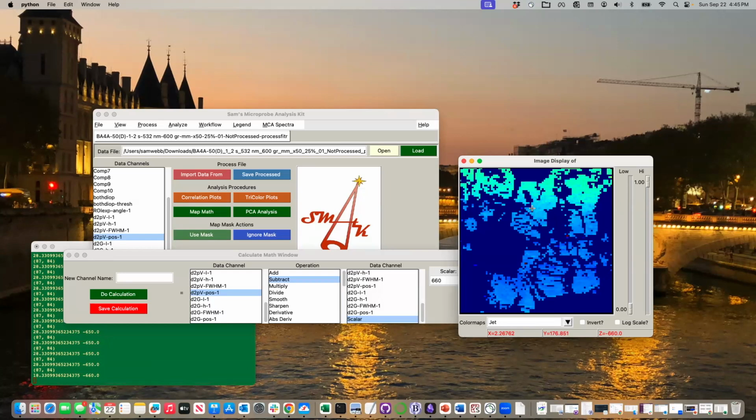So this kind of begs to look at the X-ray data as well as the Raman data together and see how these things shift. And you can do this with any set of peaks. Actually do some fitting to see if there are shifts or changes in the data set. Integrate areas. Also use this for FTIR to look and again see if peaks are shifting or changing, or integrating different areas and actually doing a proper peak fitting rather than just a binning on it too. So it'll fit the background out.